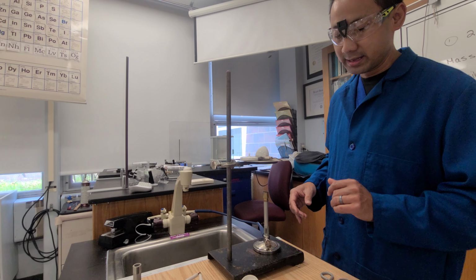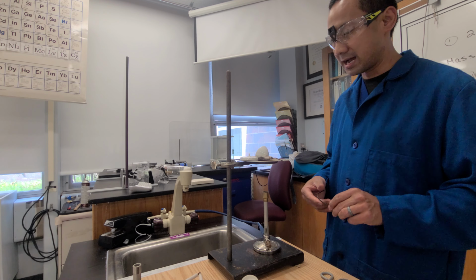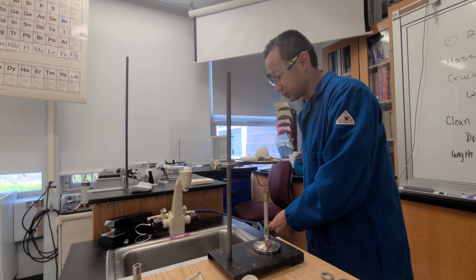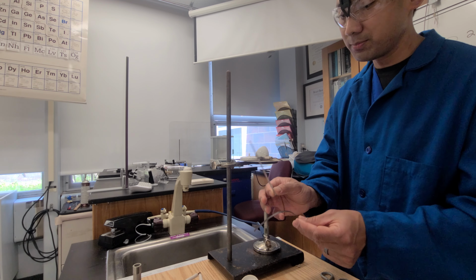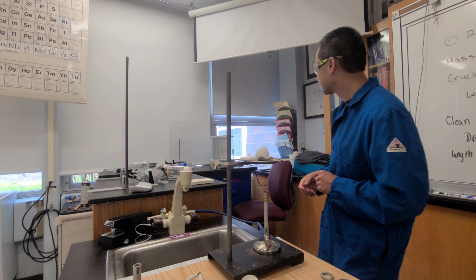and we're using a wide mouth, stout crucible, wide form. Okay. Magnesium, I have some 220 grit sandpaper here that we are going to use to polish the magnesium. So it's going to go from this black to hopefully this shiny metal. So this is what standard magnesium should look like when it's fresh.